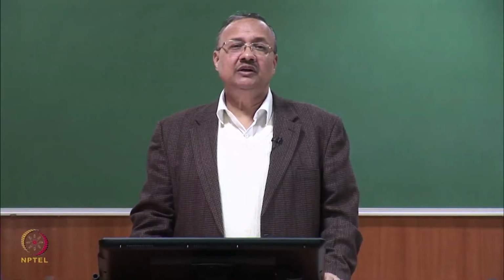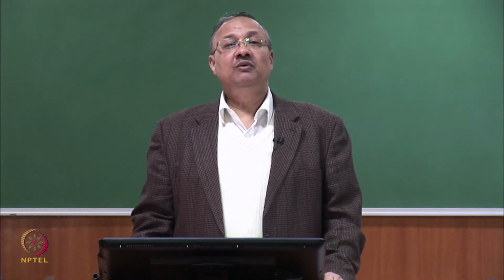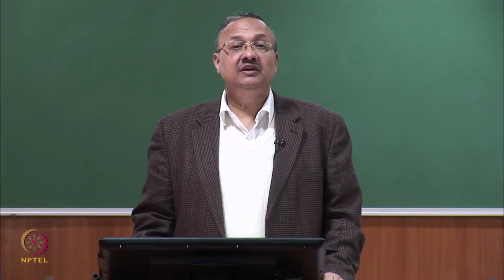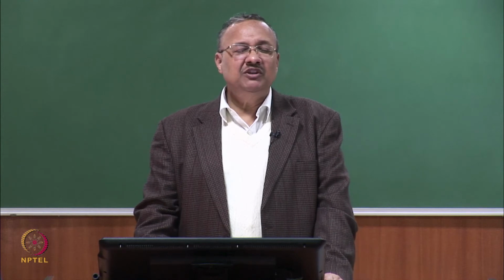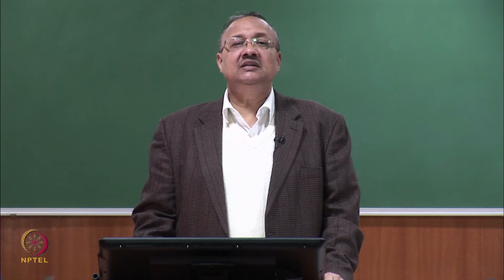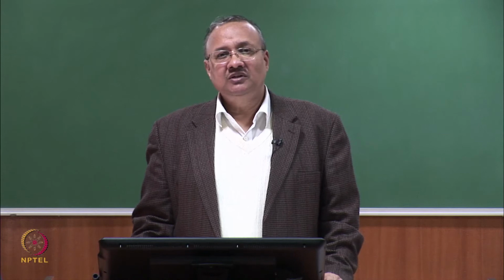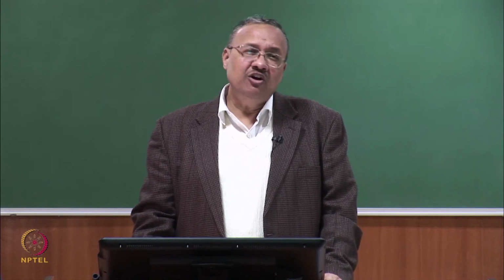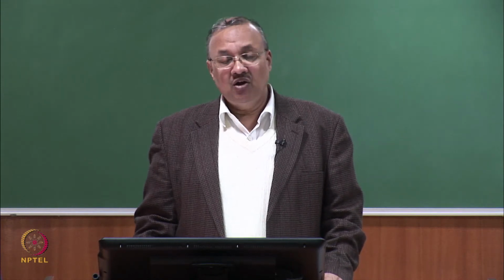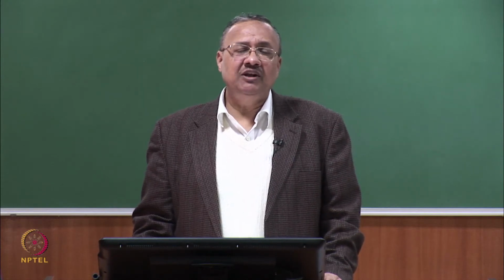So, welcome back to the next module of surface characterization. In the last module we talked about FTIR in ATR mode, where we tried to look at surface characterization. Now, I am coming to a technique which is not really a surface characterization technique, but is very useful, and at times it can detect materials at low concentrations also, and it is very specific to certain kinds of changes. So, I will not call it a surface characterization technique, but it is used a lot nowadays in nano modification, in nanomaterials, in application of nanomaterials.